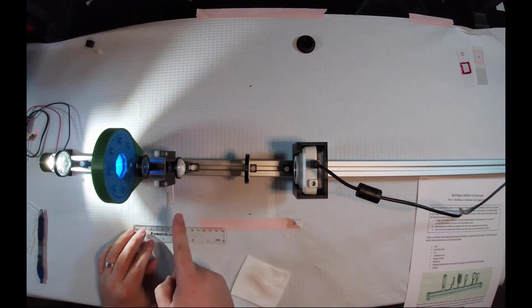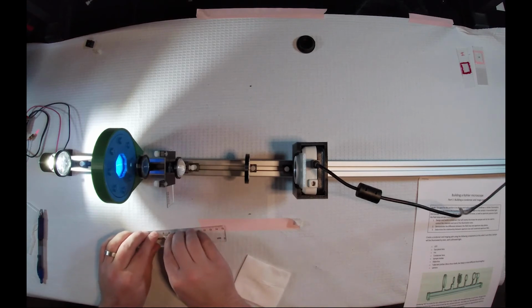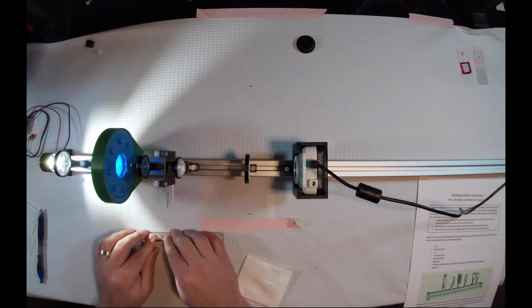So again, 35 millimeters to our sample, you have 1 millimeter of light that's being illuminated. Calculate what the numerical aperture of this system is when our iris is closed. Go ahead and pause the video to run through those calculations.